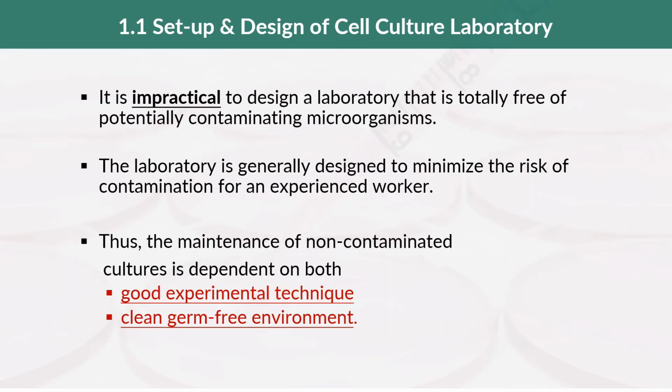Of course, it is impractical to design a cell culture lab that is totally free of any potentially contaminating microorganisms. Almost impossible, right? Generally, cell culture labs around the world are designed to minimize as much as possible the risk of contamination for an experienced scientist. So for all of you taking cell tech, we're going to try our very best to train ourselves to be as cautious as possible, to have really good techniques, to be like an experienced cell culture scientist.